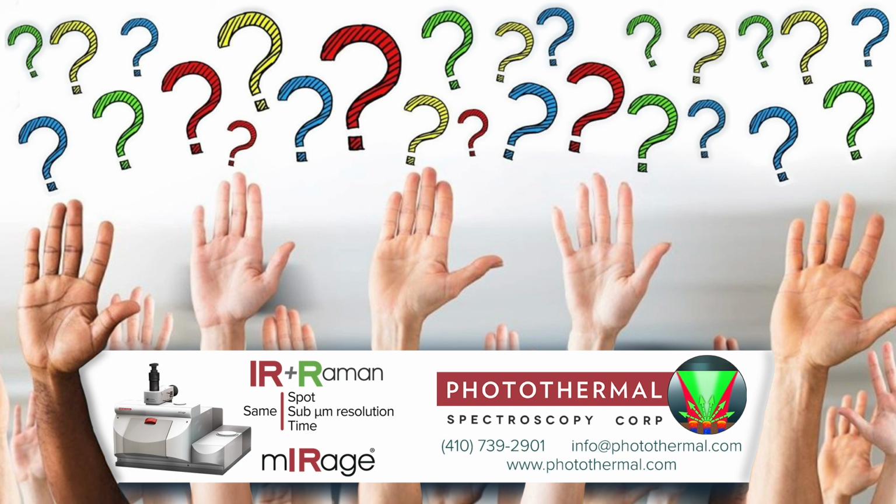Thank you. In fact, the next one I might take for myself. It says, you mentioned new substrate options opening up and being able to measure glass substrates. How do you see this working? So I've actually done a recent publication using glass as a substrate for single cell classification of cancerous and non-cancerous cells. And it's really interesting because now, for the first time really ever, you can do infrared spectroscopy on glass. There are a couple of caveats though.